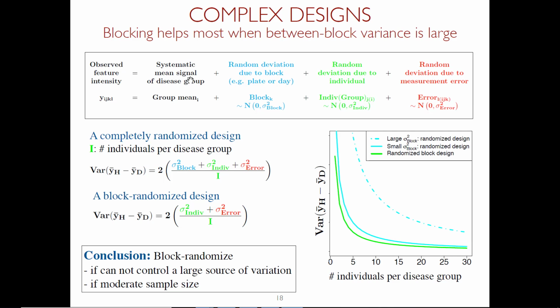And from that point on, what you really want to look for is what can affect protein abundance, right? If you have things which vary between subjects, but you don't know how much they affect what you will measure, they will be less important. But if things really affect the abundance of the protein, then this will be quite important.